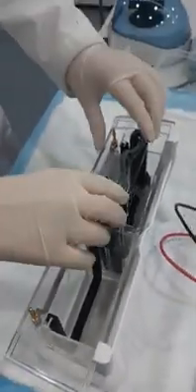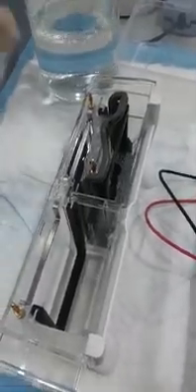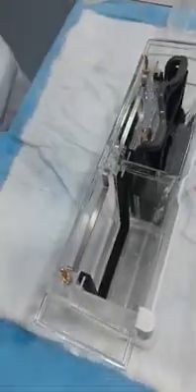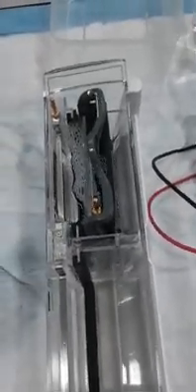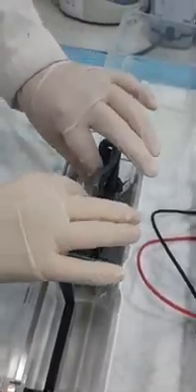It should not leak, but if you do discover a leak just continue to top up the buffer. Get rid of any bubbles, then remove the comb. The gel is already made for us — during storage the comb is left inside the gel, so just remove the comb before you start loading.